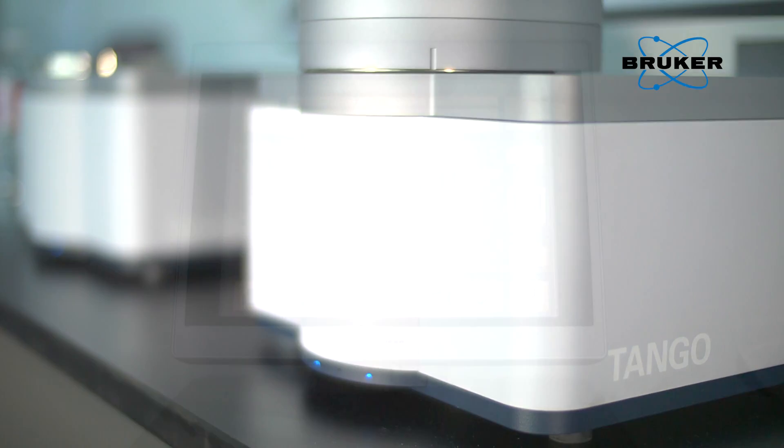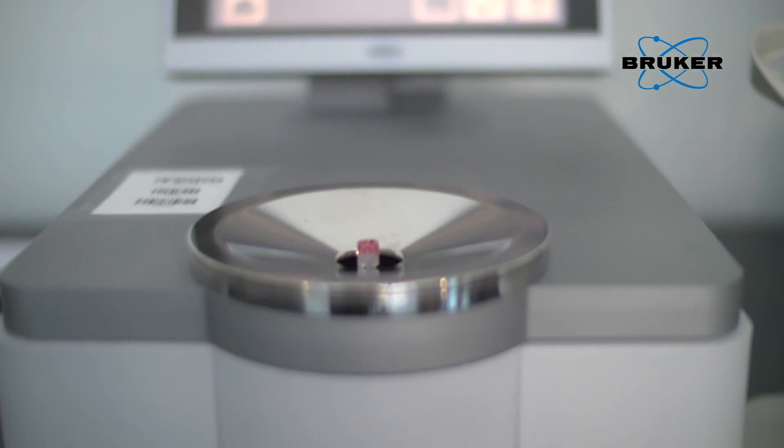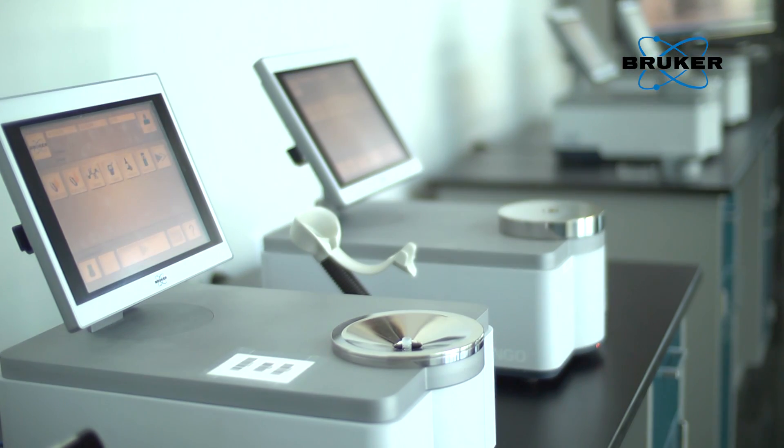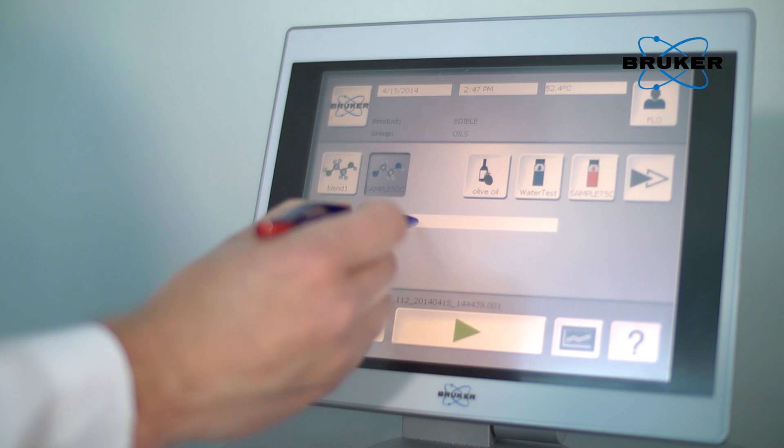With Tango, your NIR analysis speeds up. Tango has exactly what users require of an FT-NIR spectrometer suitable for industrial use: robustness, high precision, and straightforward operator guidance.